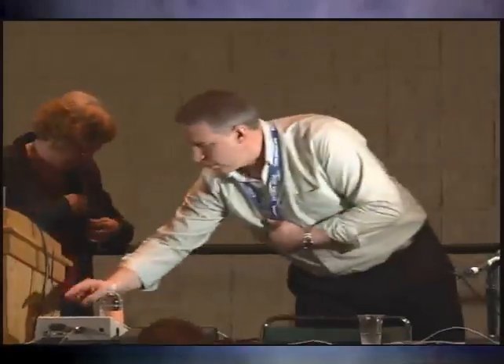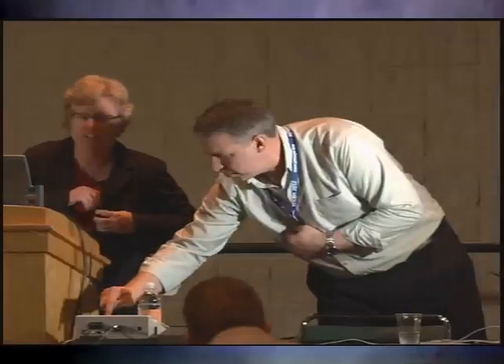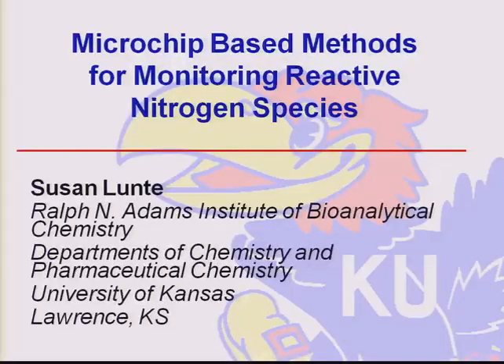Okay, well, I thank everybody for sticking around, and I've enjoyed all the presentations. What I'm going to talk about today is a combination of fluorescence and electrochemistry. A lot of this work was inspired by Christian Amatore's work looking at peroxynitrite and nitric oxide using in vivo amperometry. We're trying a similar approach, but using separations instead of triple step amperometry to detect the reactive nitrogen and oxygen species.